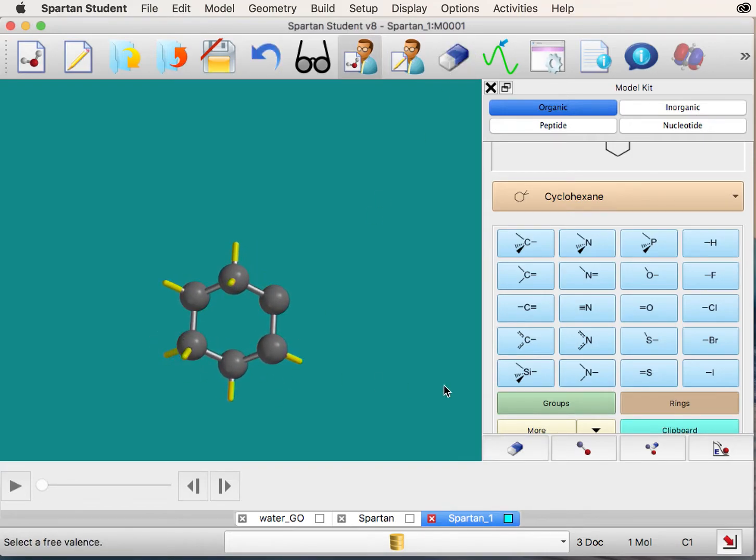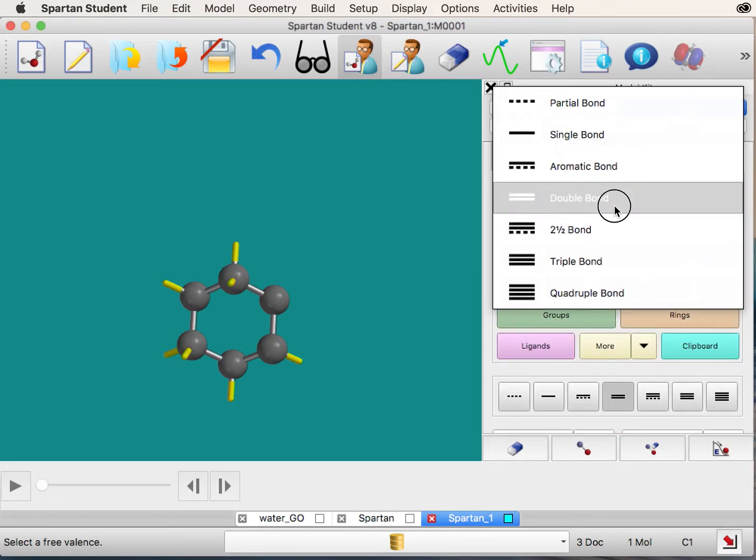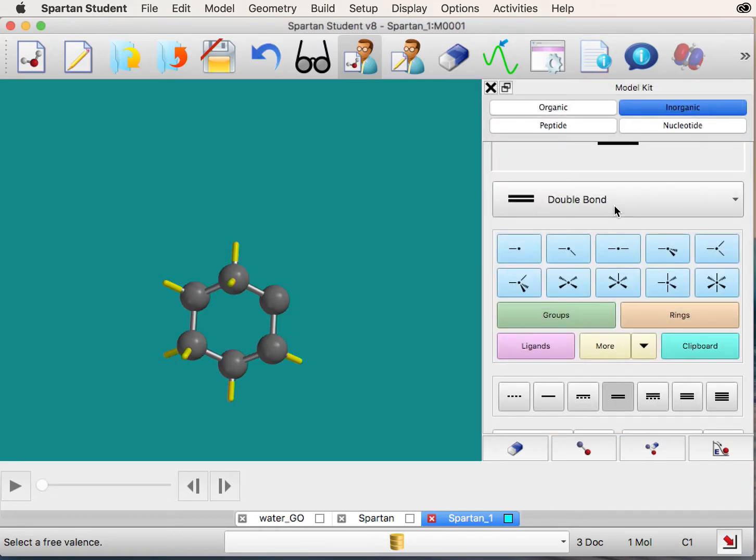Next, click the inorganic tab and select the double bond option. Double-click between the two carbons where you've removed an open valence.